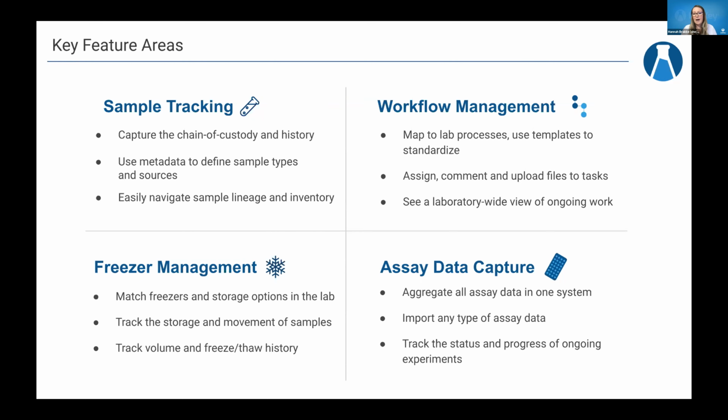And then finally, assay data capture. So really providing this place for you to aggregate all of your experimental assay data for samples in one system. We link those directly to the samples, so you see that at a lot of different levels. You can import really any type of assay data. So it's very agnostic. We're looking for tabular formats that would fit into a standard spreadsheet, and then displaying that data as well. And then you can track the status and progress of ongoing experiments with linking the assay data capture that you need to our workflow management tool.